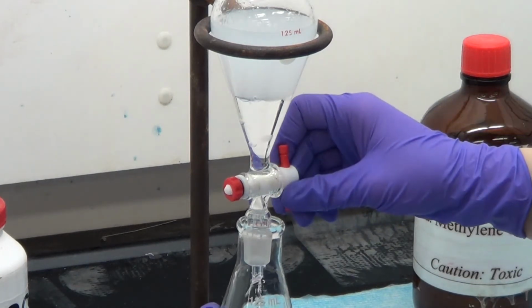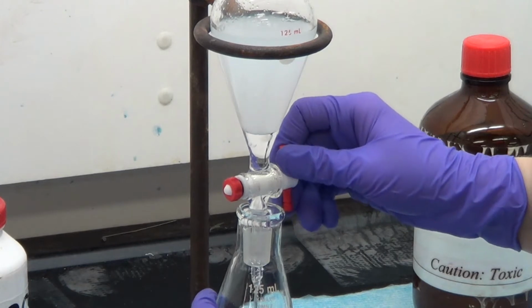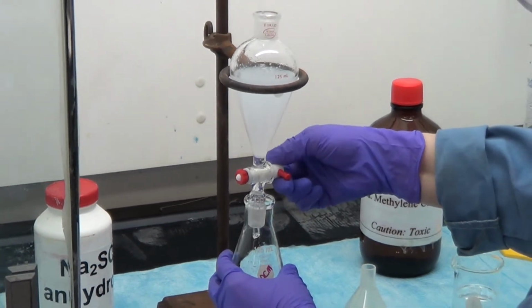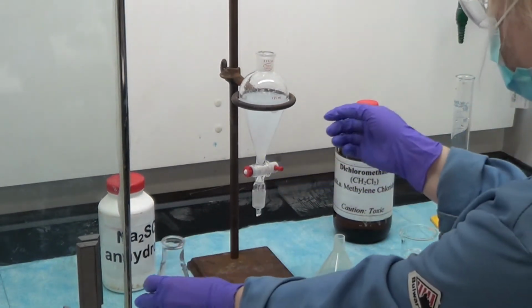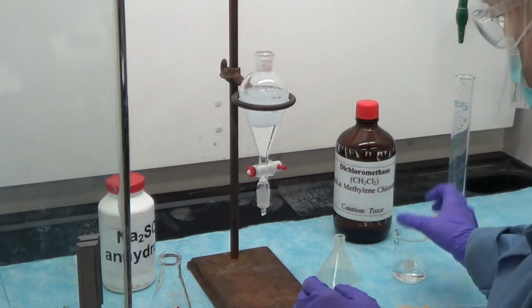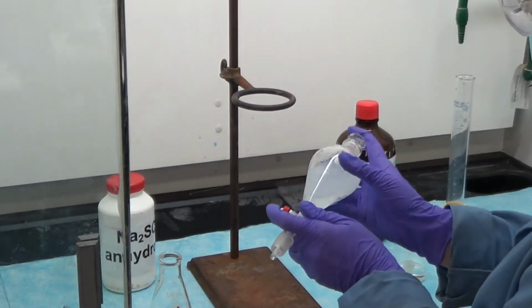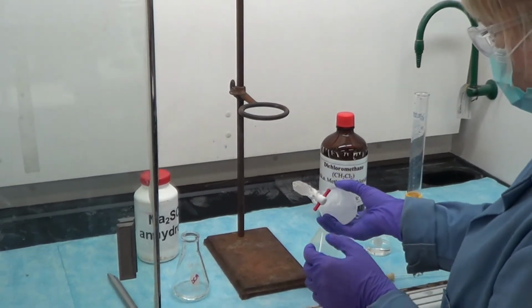The layers are then separated into separate flasks, and the aqueous layer is then added back to the separatory funnel. To know which layer is which, check the density of DCM versus water. You'll find that the DCM is more dense than water, so it is the bottom. The water is on top. The aqueous layer is then added back and new DCM is added, and the process of shaking and extracting is repeated twice more to have 3 extractions total.